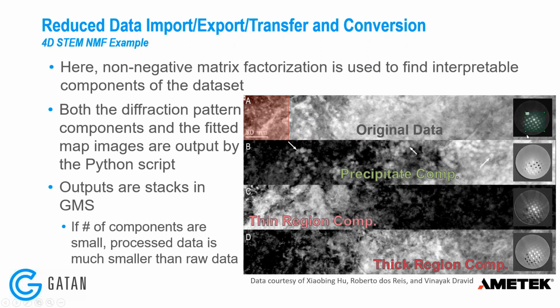And in that diffraction pattern, I can see the area that I'm summing from that diffraction pattern to produce this image. And that's great. And we can, within GMS, do all sorts of different virtual apertures and much more complicated regions of interest than just this simple square.